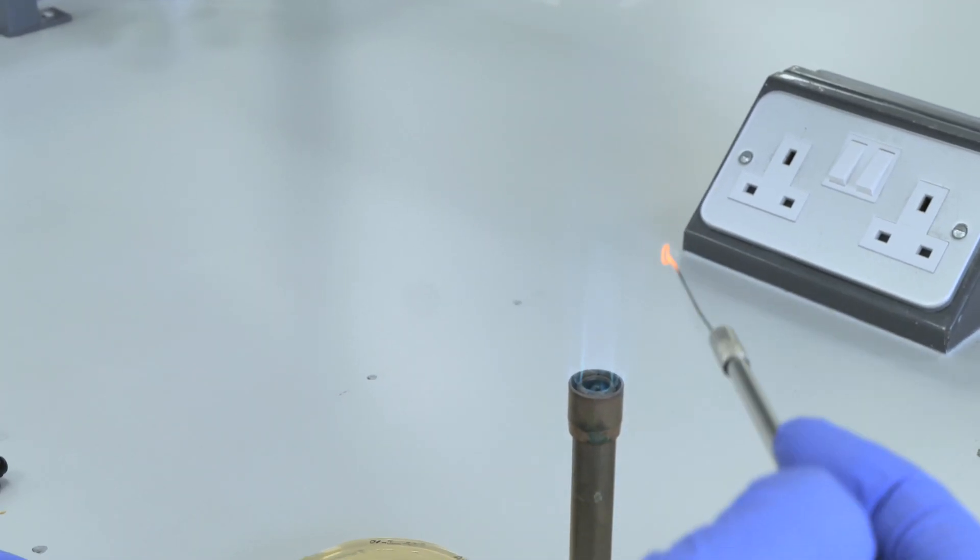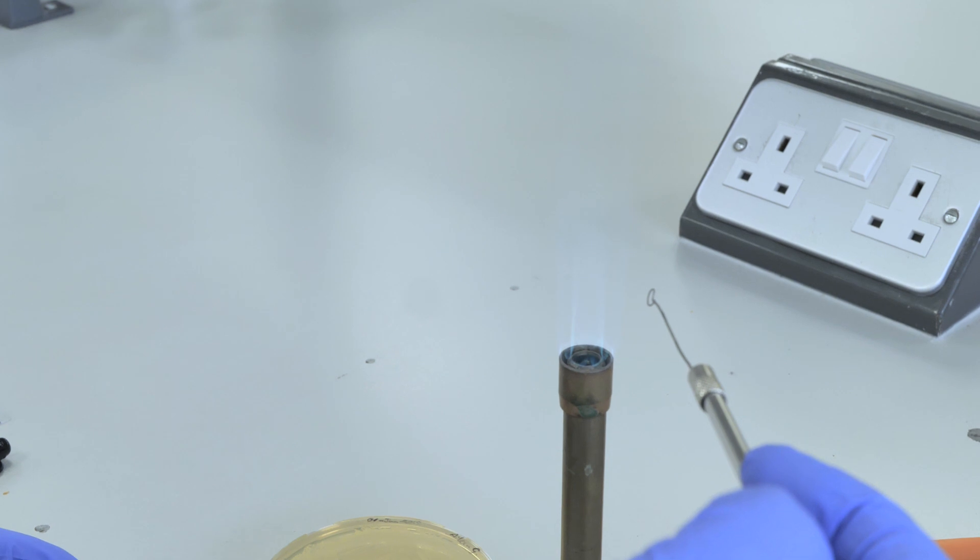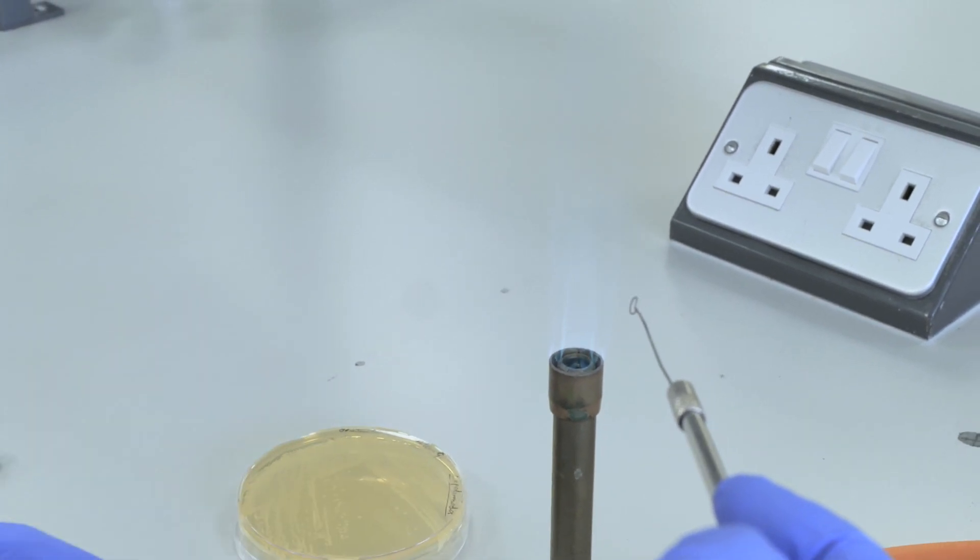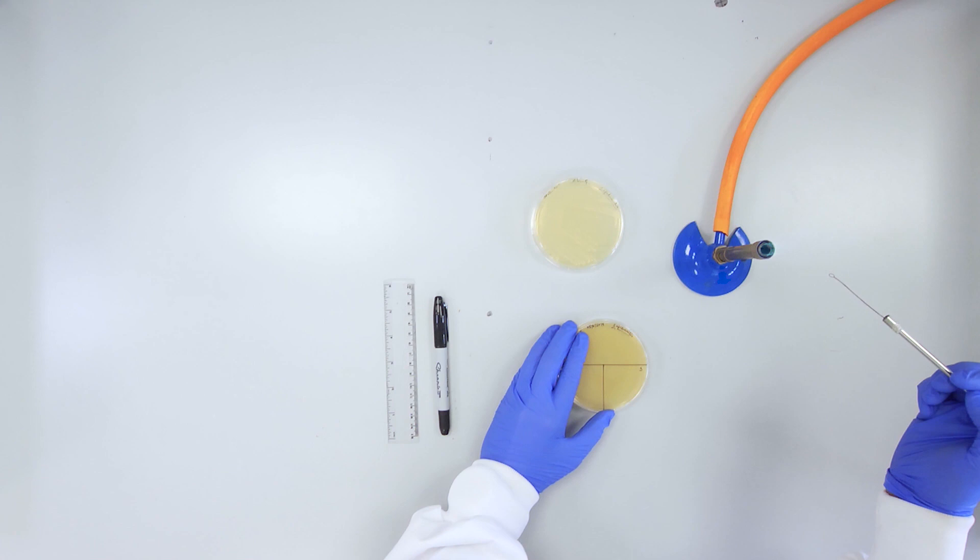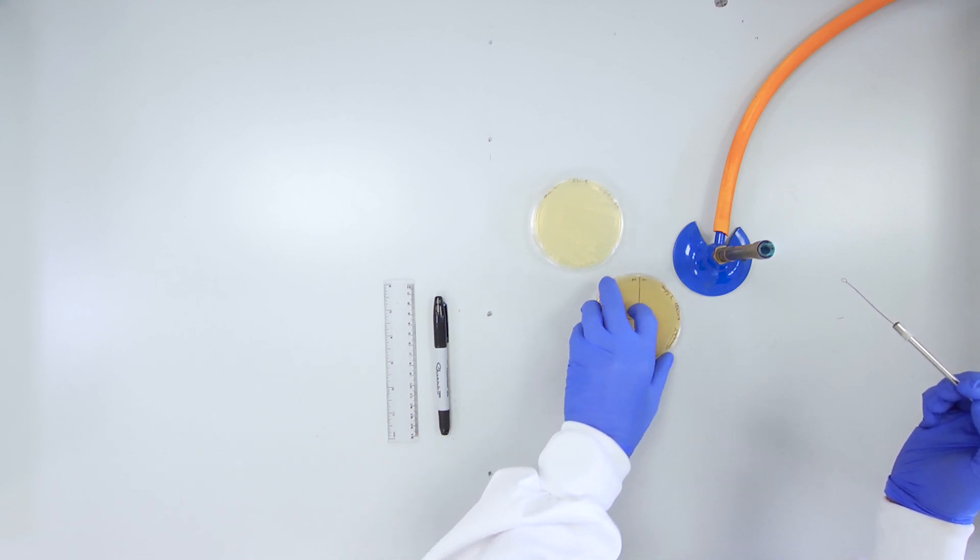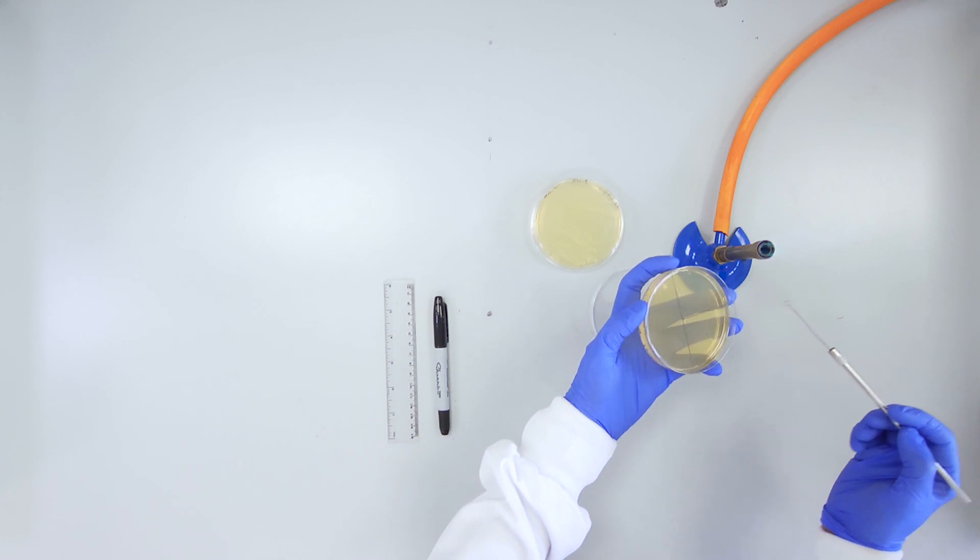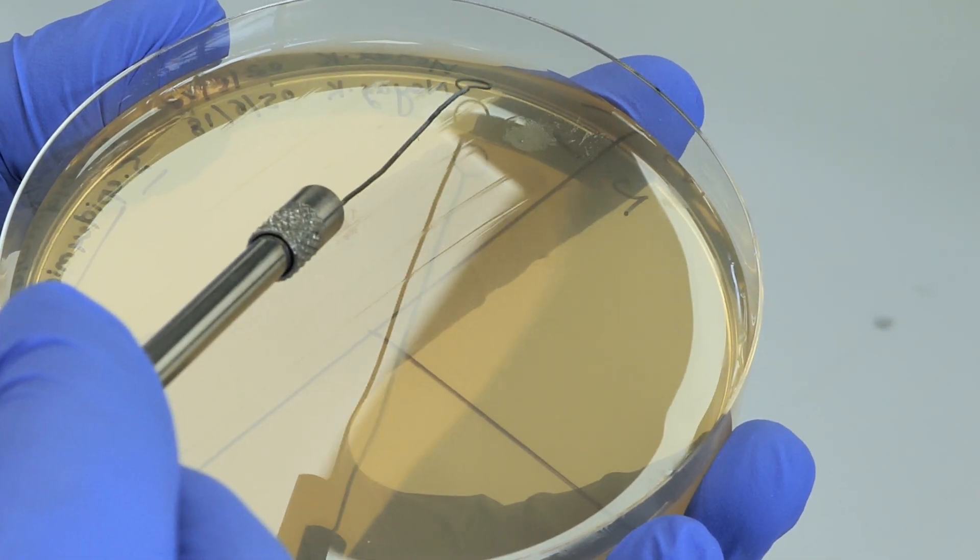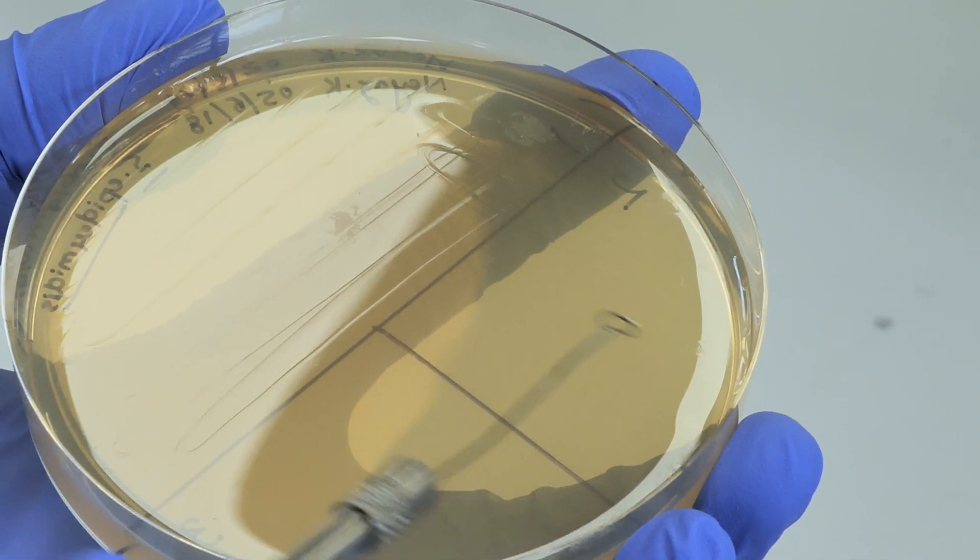Re-sterilize your loop and allow to cool for 20 seconds. Rotate your TSA plate 90 degrees to the right. Starting in section 1, recharge your loop by streaking from section 1 into section 2.